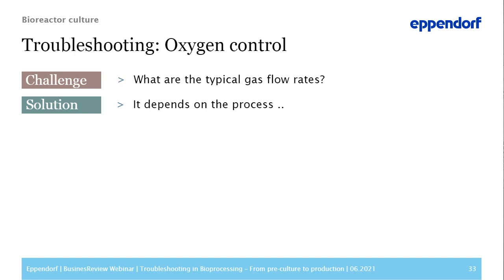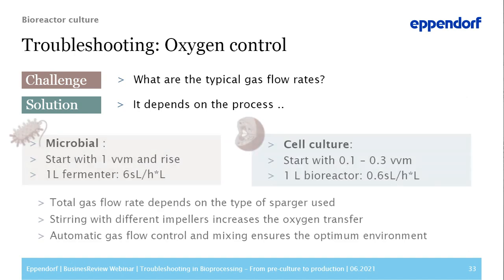So oxygen is another parameter that needs to be carefully controlled in most cultures to get a successful run. Now, in a classical E. coli fermentation process, oxygen is generally the limiting factor. So therefore, using an optimized gas flow rate is very important to maintain a healthy culture. So for this, it is important to use appropriate gas flow rates which can meet the demand of your culture.